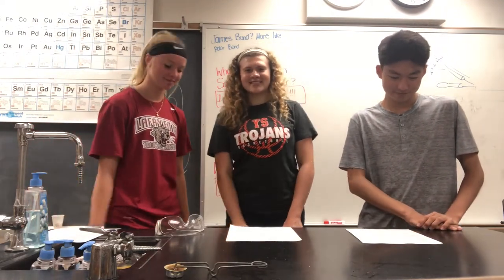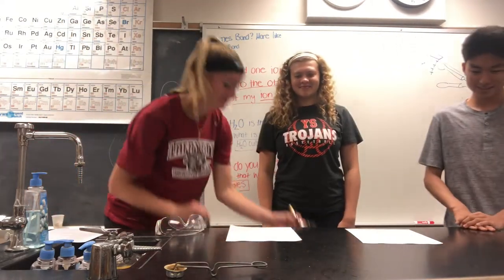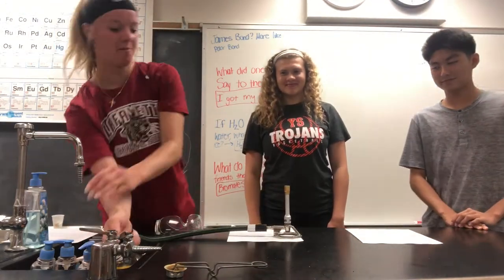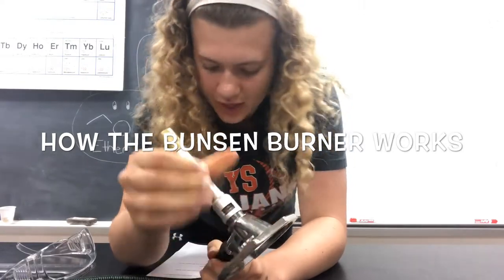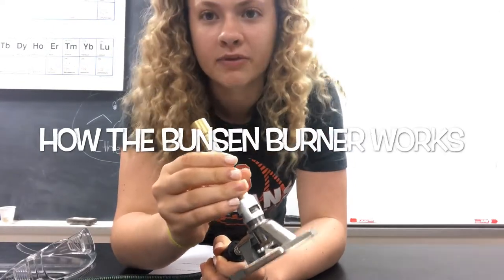First, get out the Bunsen burner. The bottom knob controls the height of the flame and the methane. The barrel controls the oxygen intake and the type of flame.